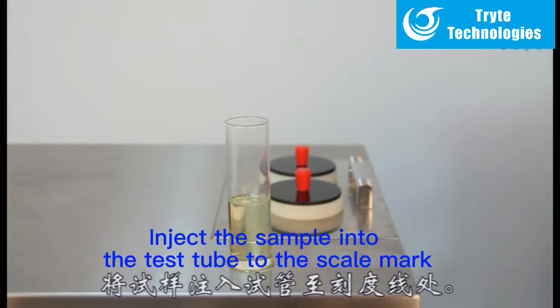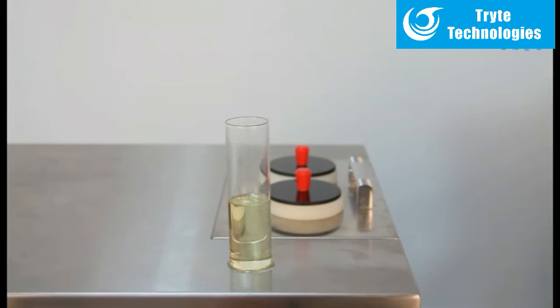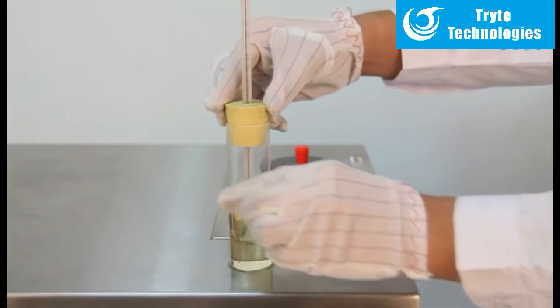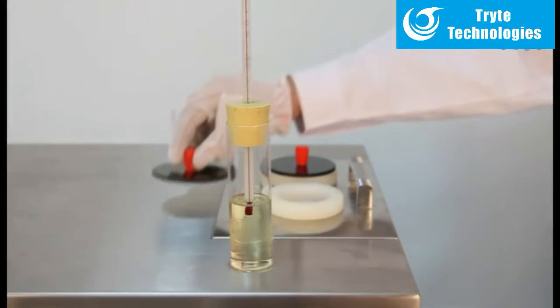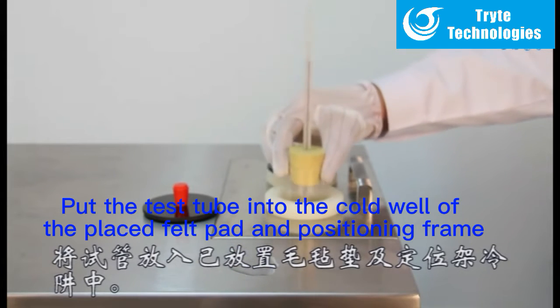Inject the sample into the test tube to the scale mark. Plug the test tube with a cork with a thermometer. The thermometer and the test tube are on the same axis, and the capillary starting point of the thermometer liquid ball shall be immersed at 3 mm below the liquid level of the sample. Put the test tube into the cold well of the placed felt pad and positioning frame.